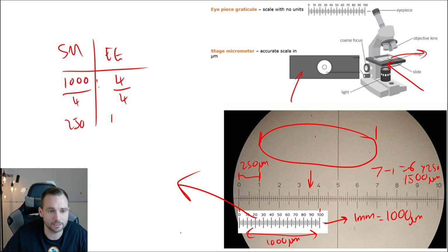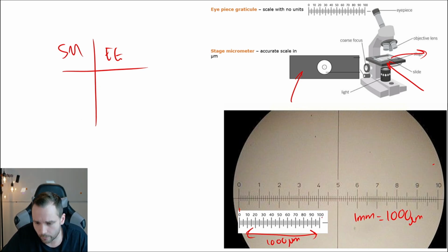So this is where you get decimal numbers. So what we're going to do now is say that this reads up here to 4.1. And this is what's likely to happen. The lens, when you look down it, is unlikely to be, as we stated at the beginning, exactly right. It could be somewhere between sort of times 40 and times 39. So we want to know what the true length of this measurement is.